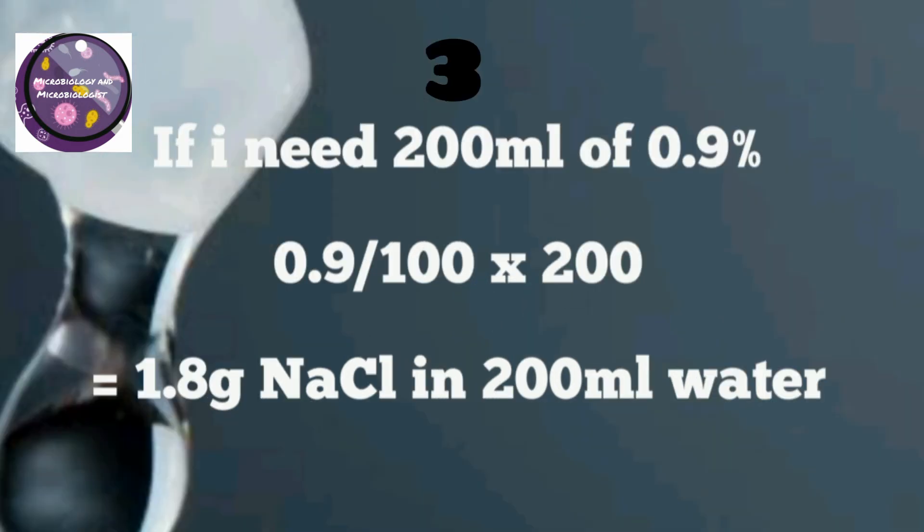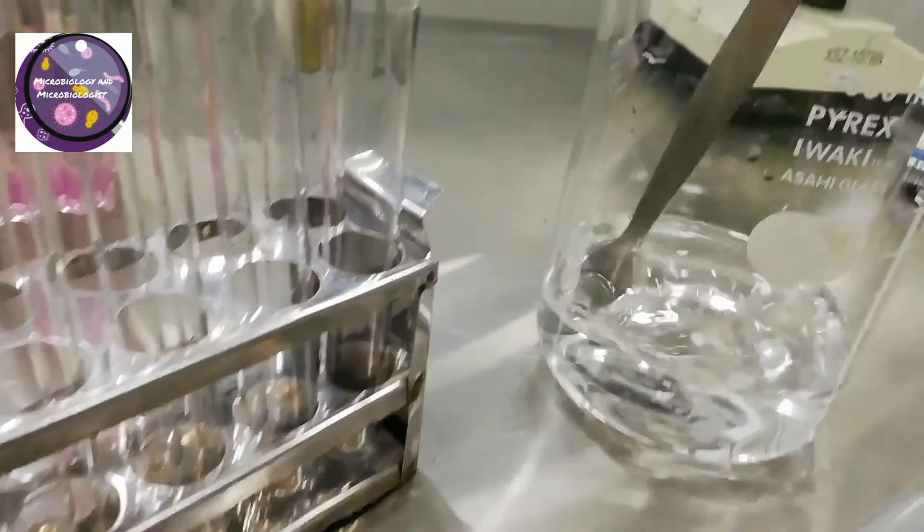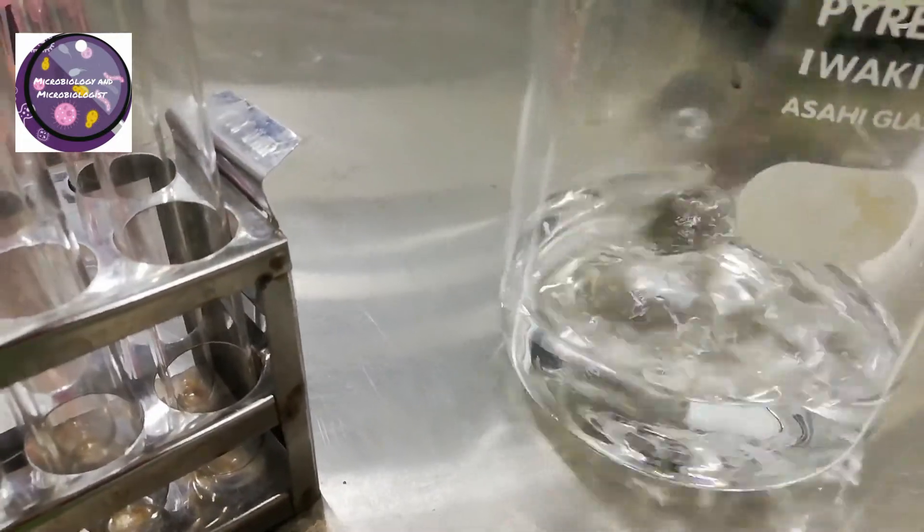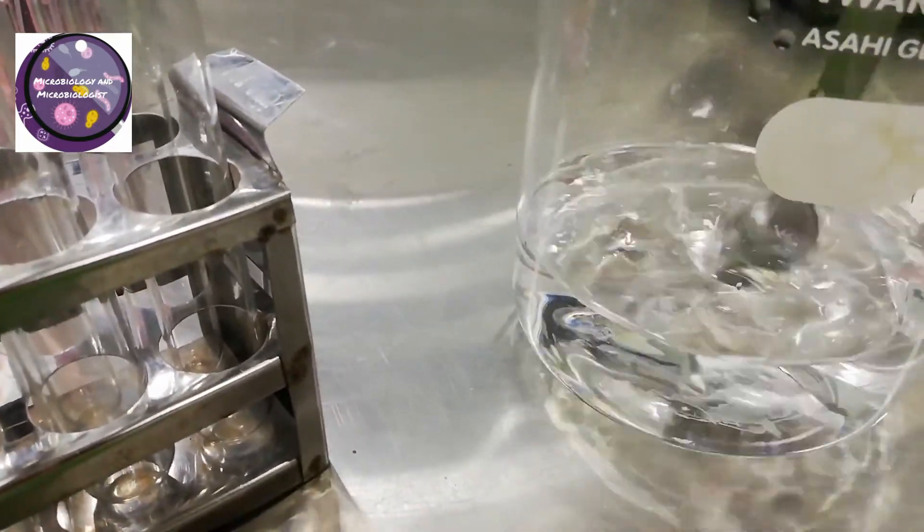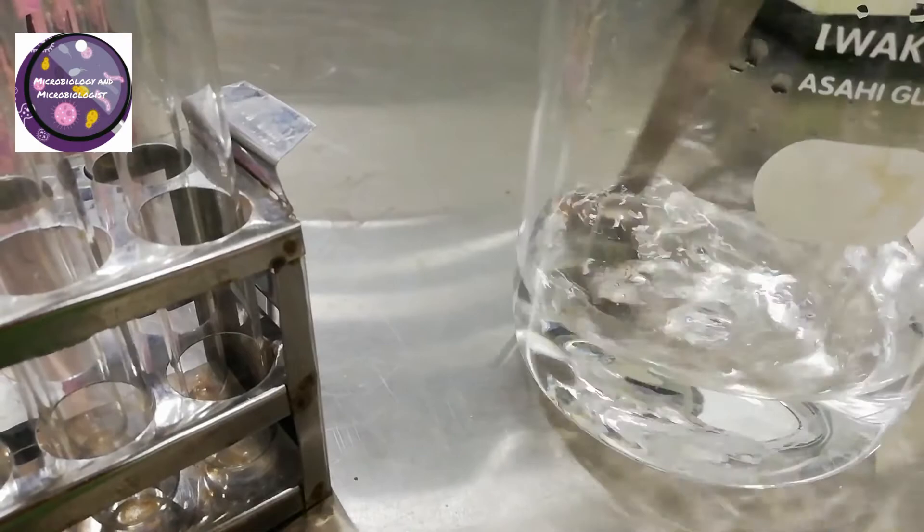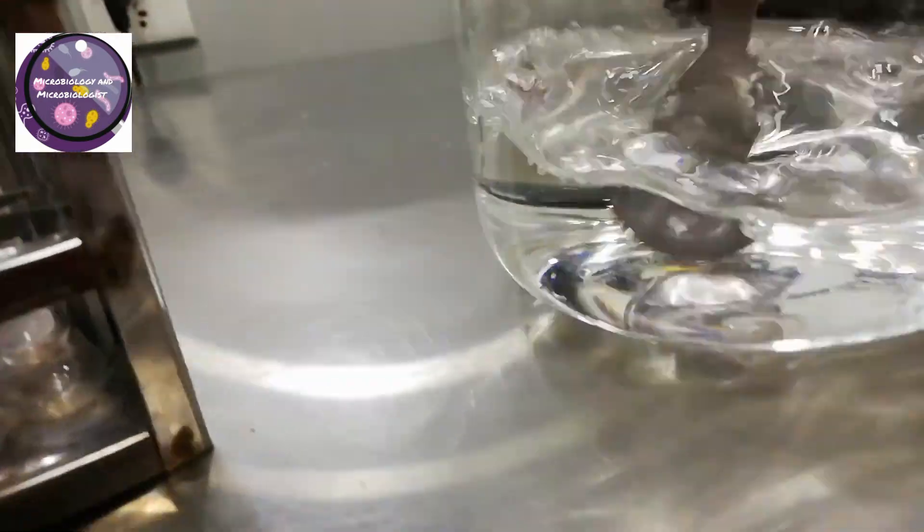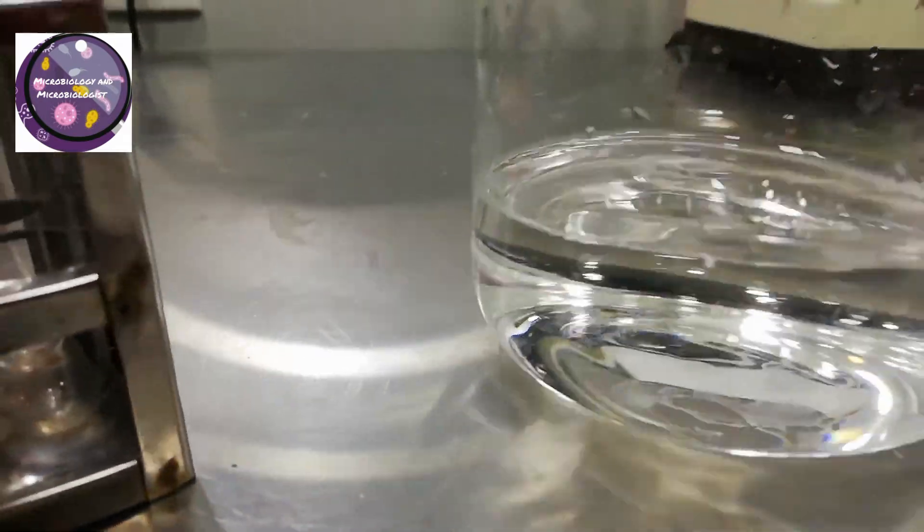Here I am preparing 200ml of 0.9% normal saline, so I have added 1.8 gram of NaCl that is pharma grade, and I am mixing it in distilled water.